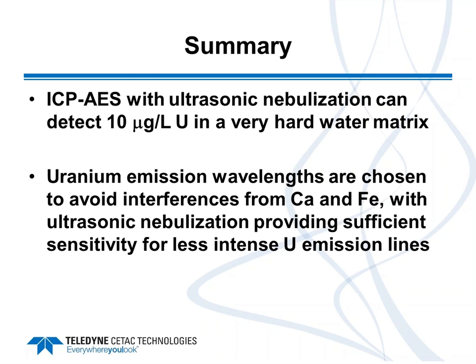Do you see any memory effects by using Tygon rather than Teflon tubing for the sample line? There can be if you're collecting more salts that may stick to the walls of the Tygon. Most of the memory you will see with the USN can come over time in the heated part of the J-tube. If deposits do build up in there and they are part of the analyte mix you want to look at, that's something to always monitor. In the Tygon line, yes, it can occur. Typically, I recommend keeping the line as short as possible, and certainly you can use Teflon or an FEP line so things don't stick as readily.